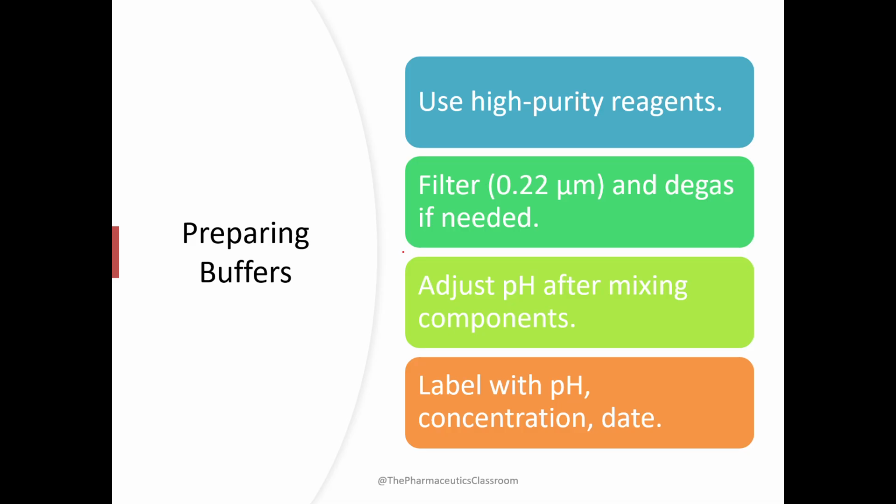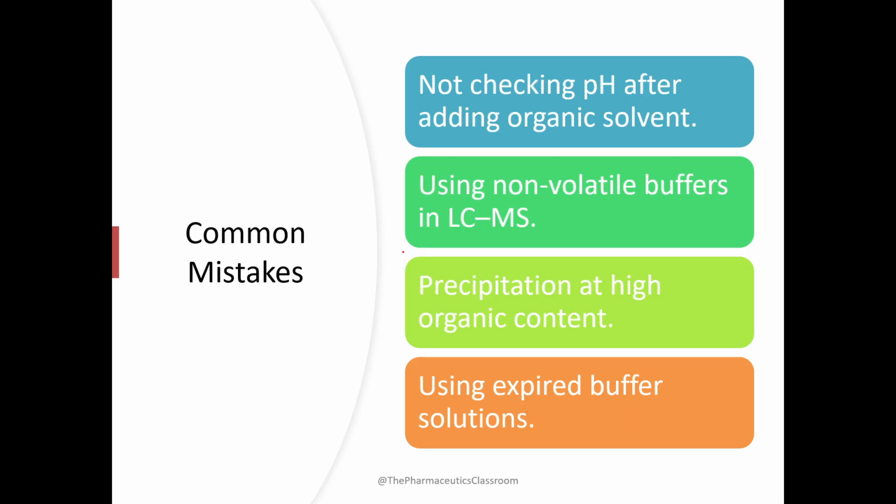These are the common mistakes. People do not check the pH, and sometimes people use phosphate buffer with a mass detector, which is not recommended.